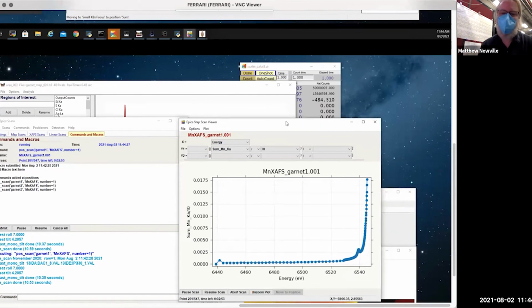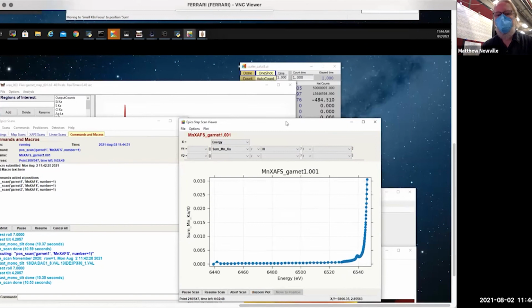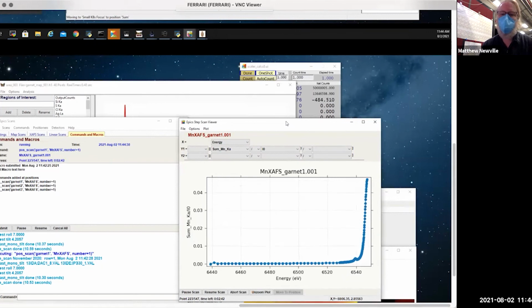And if you need to go faster for very fast dynamics, say a microsecond or so, many people will use pump-probe techniques, so they'll pump with a laser and then use a time delay after that, and then you can time the signal. We don't do any of that at this beamline, but there are beamlines dedicated to those kinds of measurements.